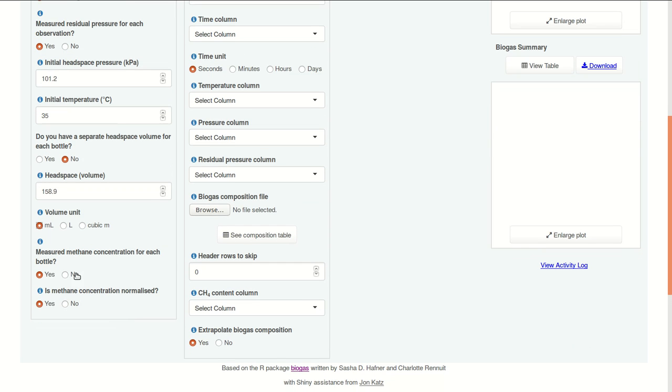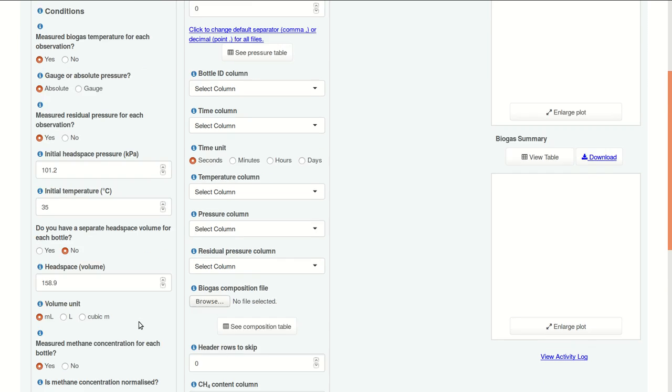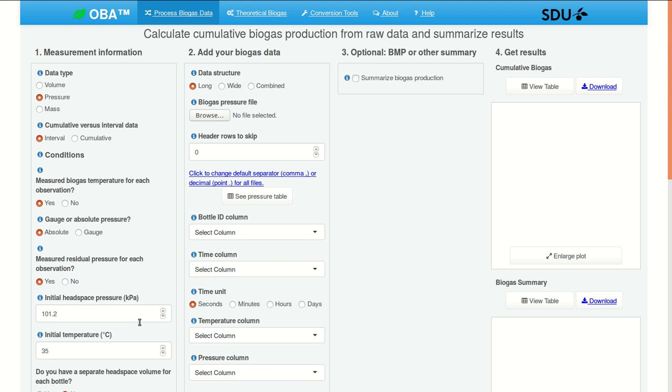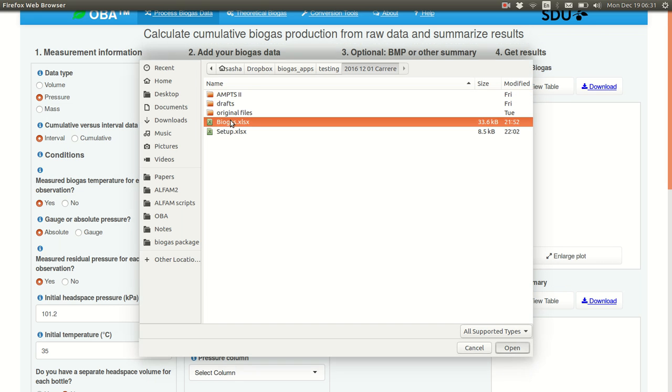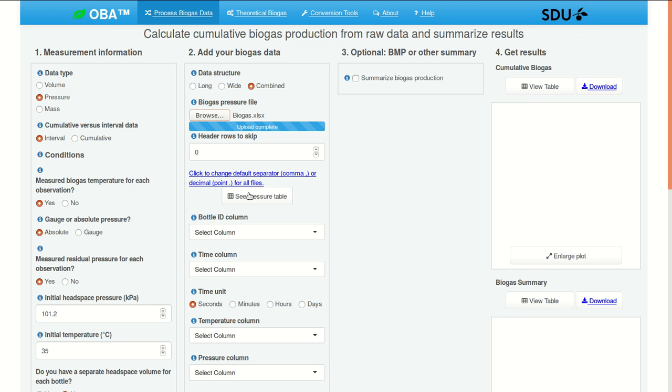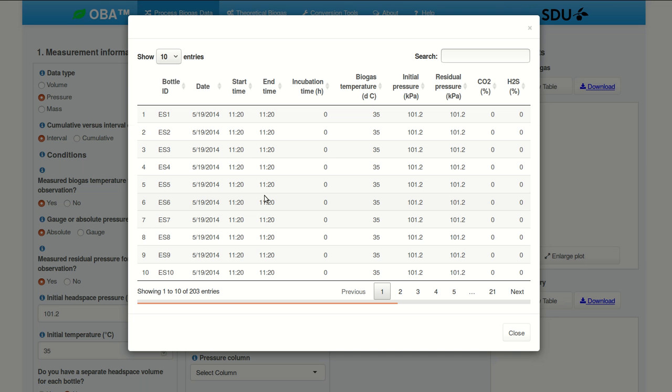And we do have measured methane concentration, and the concentrations are not normalized. Our data structure is combined. We have biogas quantity and composition as two columns in a single file. You can click this box here to take a look.